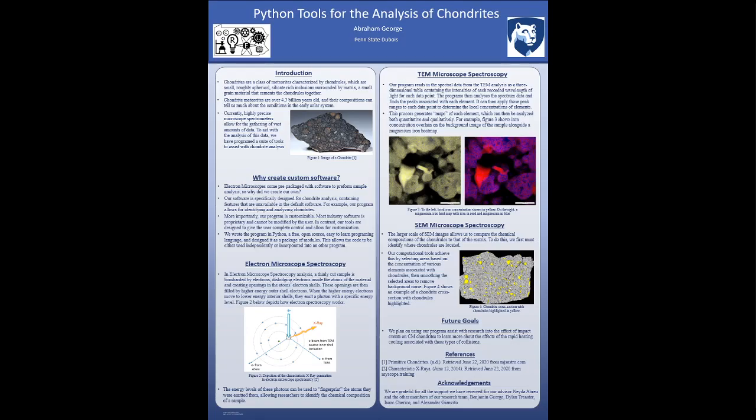Now the program does it. It's not 100% yet, but it does a lot of the legwork for us. We can then go back in and touch up a few places, but it saves us hours of time coloring in one of these images.